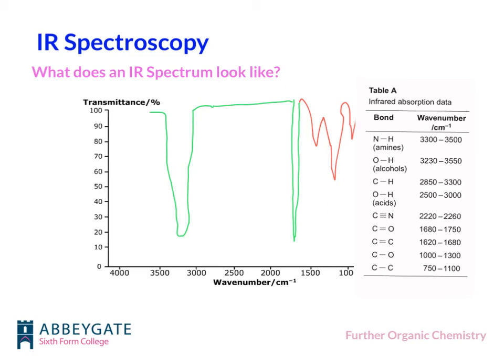If we get rid of this peak and put it back in, so CH appears around here, so we might get some peaks around here. Then we go, oh, all I've got is some peaks just before 3,000, so that would be my CHs, it's a sharp peak.